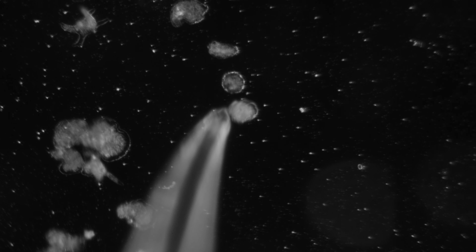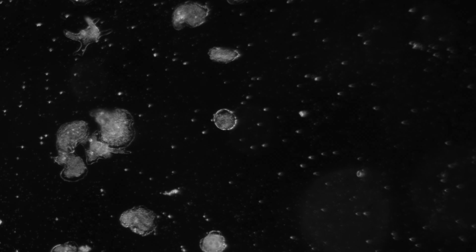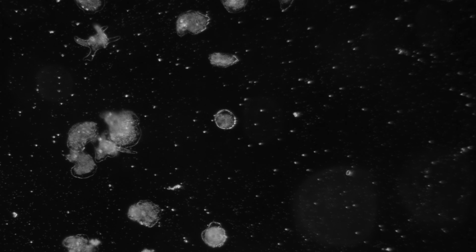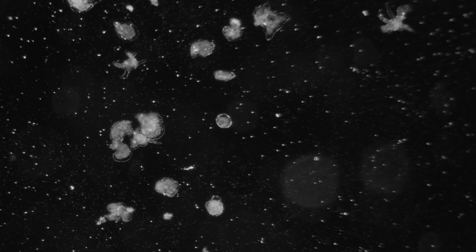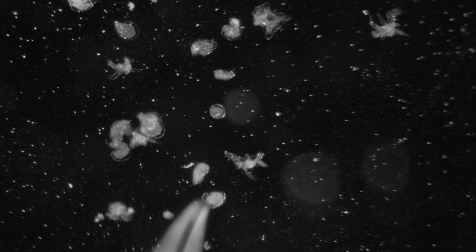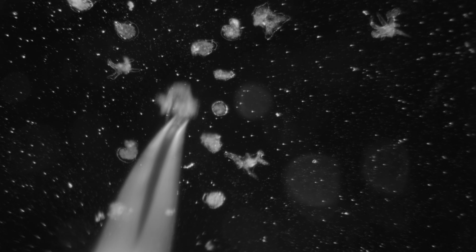This one appears to have some food in it, so I'm not sure, but you can see it's much smaller and wrinkled. This one looks very promising. Almost empty, only a hint of the granular material. Here is another floater. So they take many forms morphologically, but the cyst candidates are only the round ones.